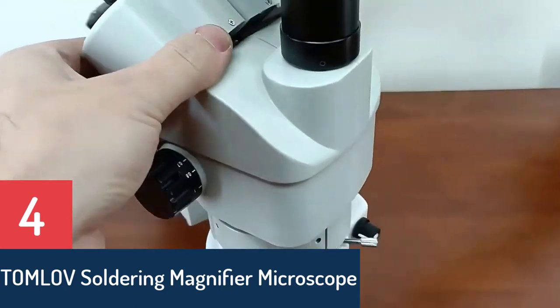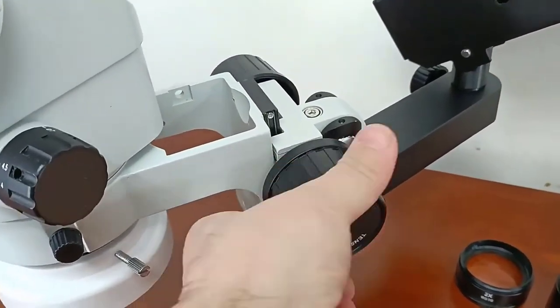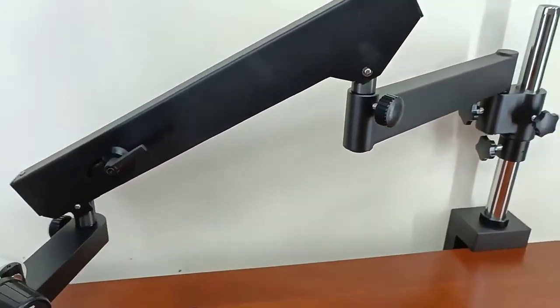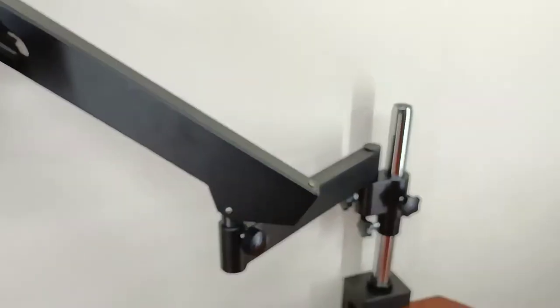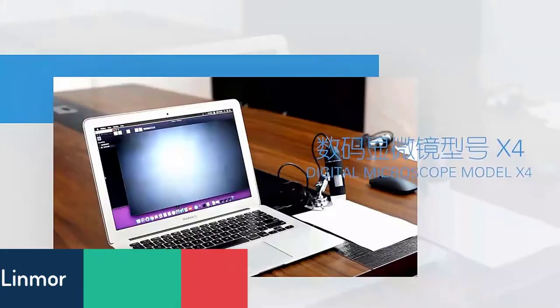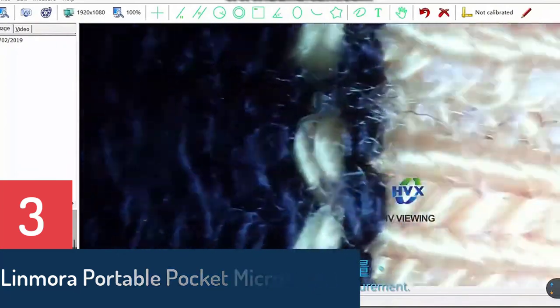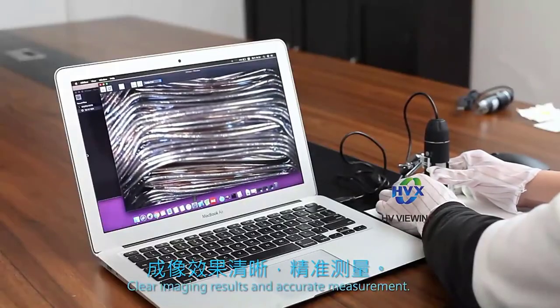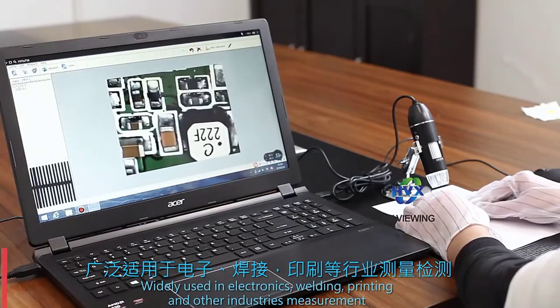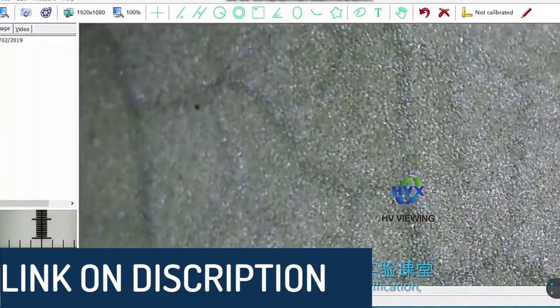Using 2.0x objective lens: 7x–90x, 40mm. Head mounting size 76mm diameter. Package includes: 1x trinocular stereo zoom head, 1x pair of super wide field 10x/20mm eyepieces, 1x pair of eye guards, 1x dust cover. Optional: 1x 0.5x auxiliary objective lens (working distance 160mm), 1x 1.0x auxiliary objective lens, 1x 2.0x auxiliary objective lens (working distance 40mm), 1x 0.5x C-mount adapter.